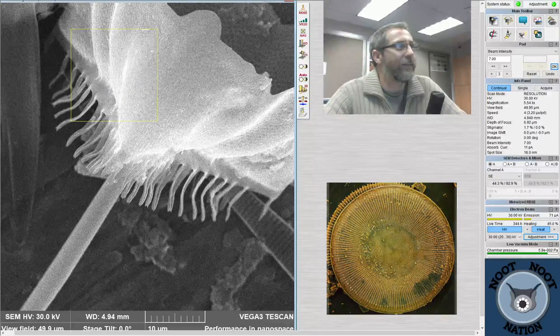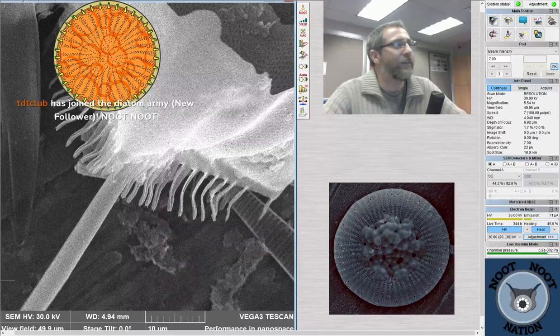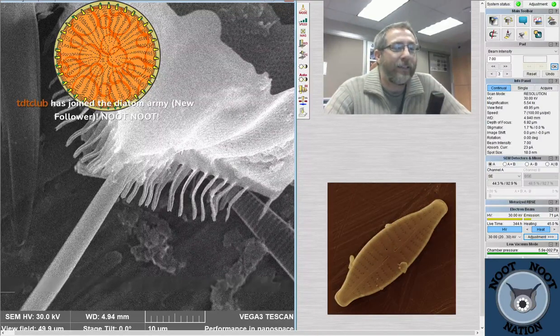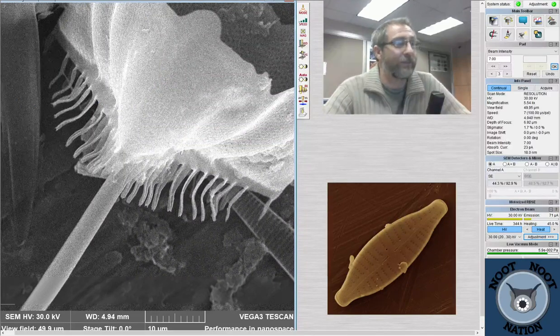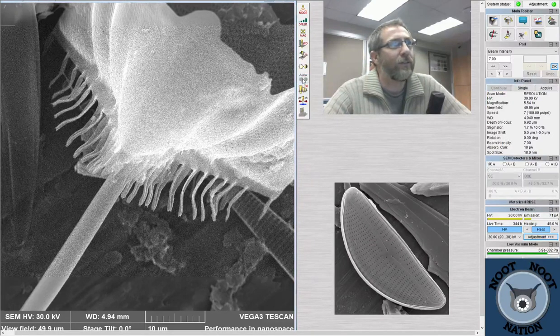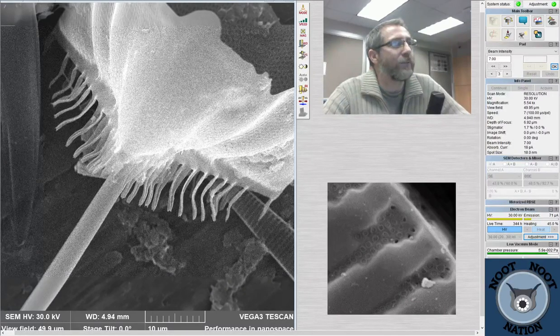If you don't know what a diatom is or what we could possibly be looking at, diatoms are a type of algae. They live in any kind of aquatic or subaquatic environment, and they generate a large fraction of the oxygen that we breathe, and they're also sort of the base of the food web for organisms that live in those kinds of environments. So they're important as a component of ecosystems.